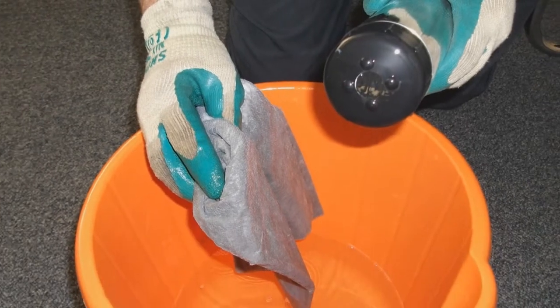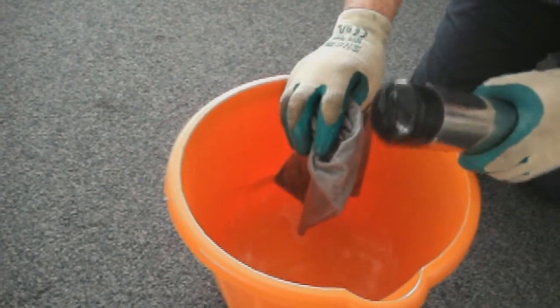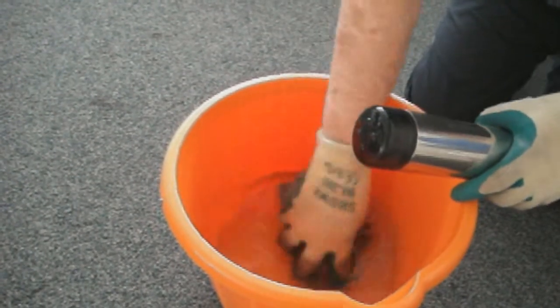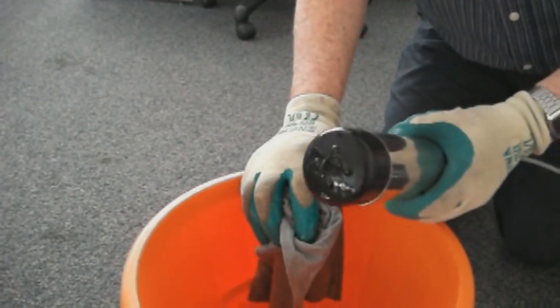In the vast majority of applications, the LDO probe will give accurate readings assisted by manual cleaning. This is simply achieved by cleaning the cap with a wet sponge or non-abrasive cloth.